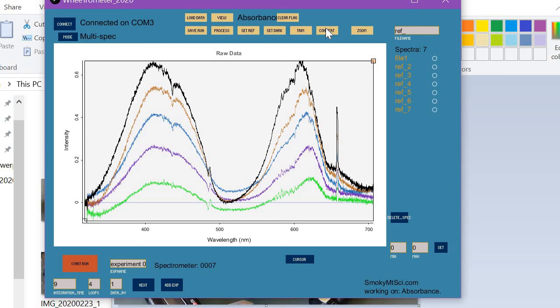All right, and you can see things went a little south on this one here, but it doesn't look too hot on that one either. Anyway, sometimes these things happen. We have fairly good spectra there. Stuff we're working on. Anyway, that's what I wanted to show you.